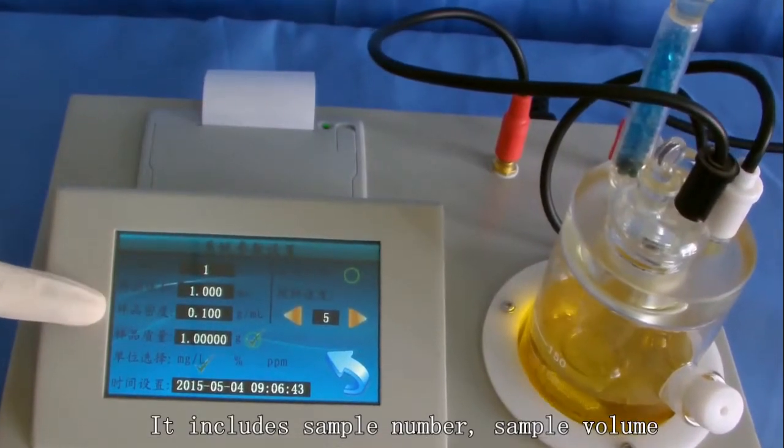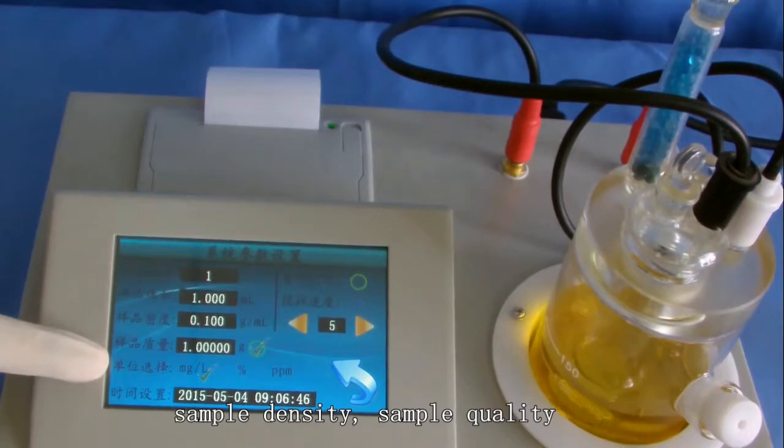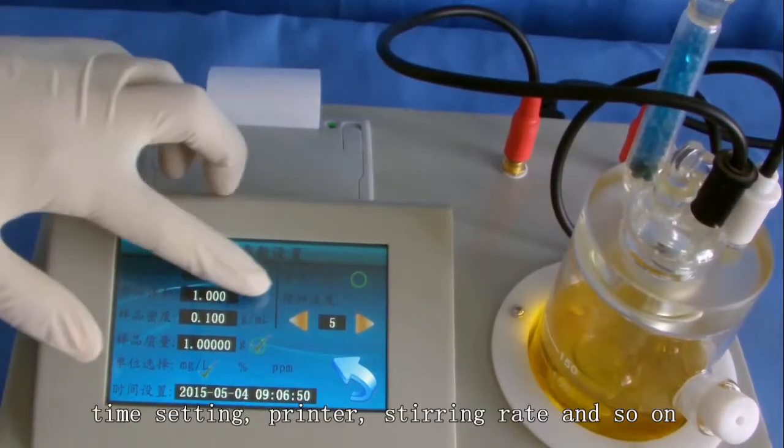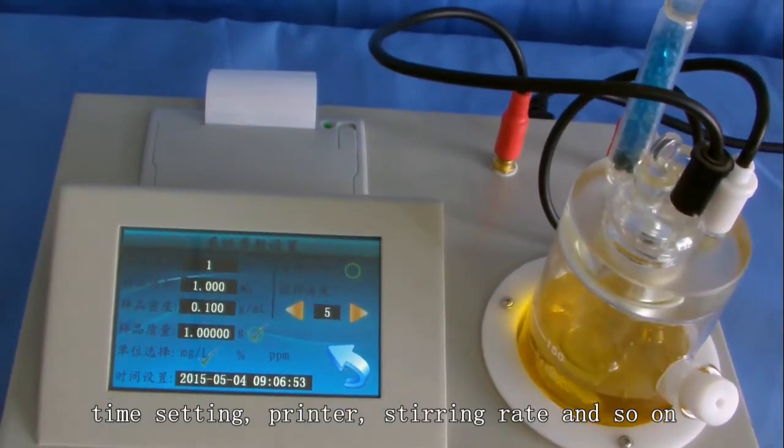It includes sample number, sample volume, sample density, sample quality, choice of sample unit, time setting, printer, stirring rate, and so on.